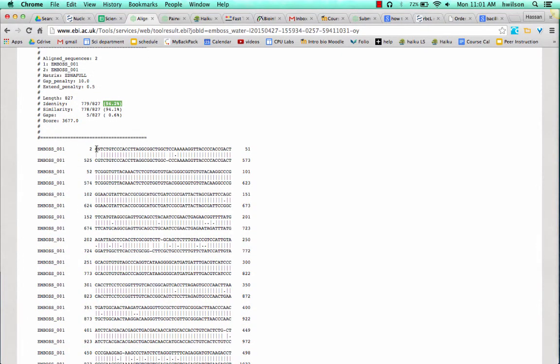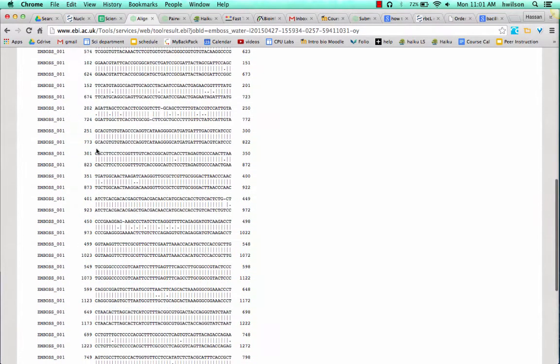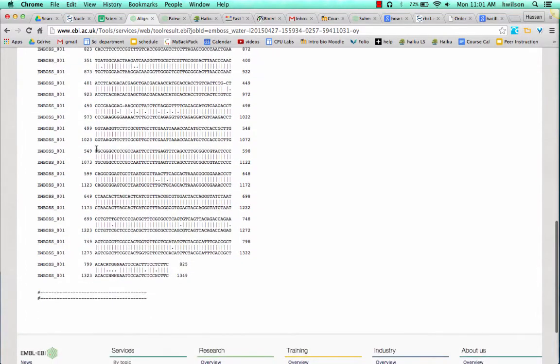It's only comparing the sequences that pretty much align between the two sequences.